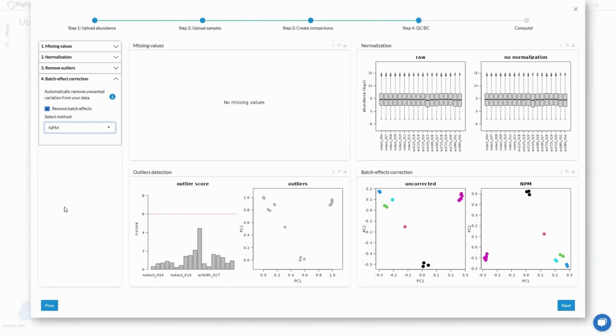So again, I strongly recommend running the uncorrected data first, then applying batch correction and comparing the effects that batch correction is having on individual protein abundances or individual gene expressions, and make sure that the two are pretty well correlated, something like log-fold change correlation across the board of at least 0.95. Otherwise, you risk introducing a lot of false positives in your data.